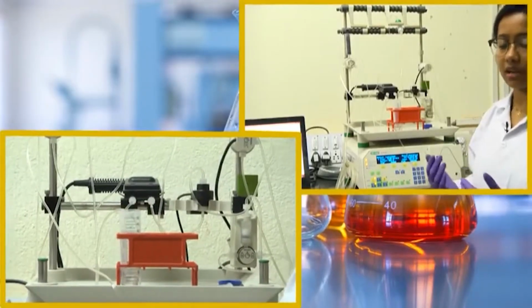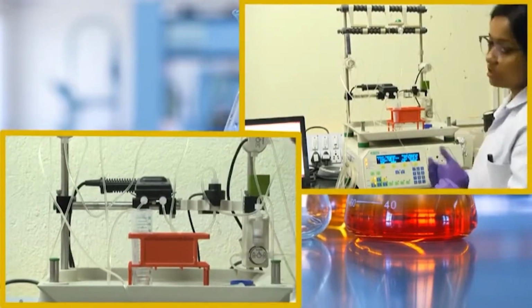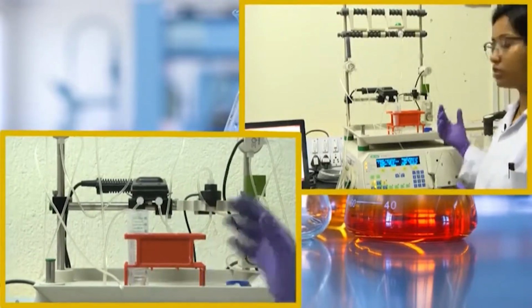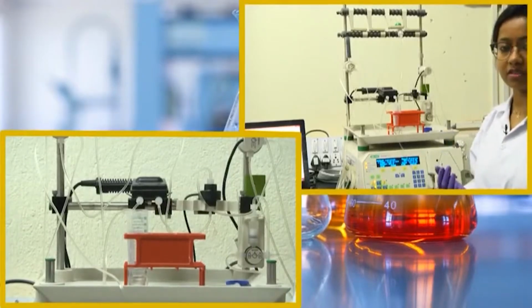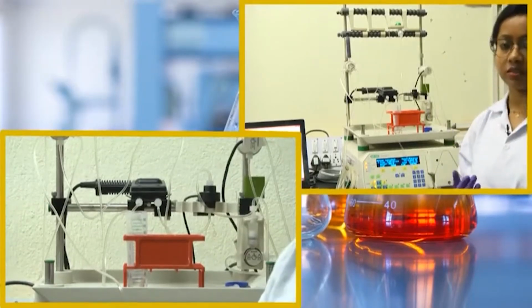So, you should see that there is no protein; your protein will not be present in the wash buffer. Other proteins will be there, but your protein will be absent. So, always save the wash solutions in a separate container, and then when you have an eluent fraction as well, you run the eluent solution through an SDS-PAGE to see where your protein is present.